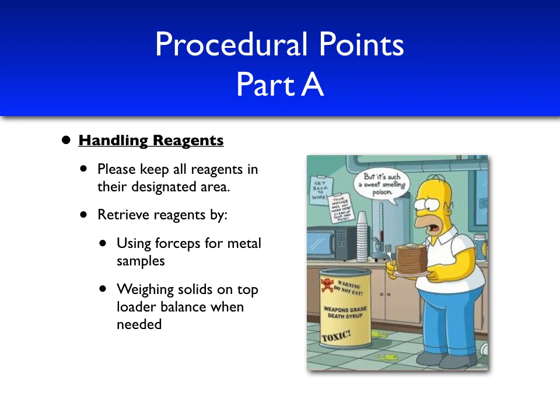If we need to obtain any solids that need to be massed, for example, some of the reagents, there is an approximate mass to use. We made all of those measurements using a top loader balance. Remember, this is a more qualitative experiment. We're not very interested in exact amounts, just observing the chemistry. You'll also notice that when I set up the beakers for many of the reagents I used, I just poured a small amount in a 50 milliliter beaker and put it in a labeled area.